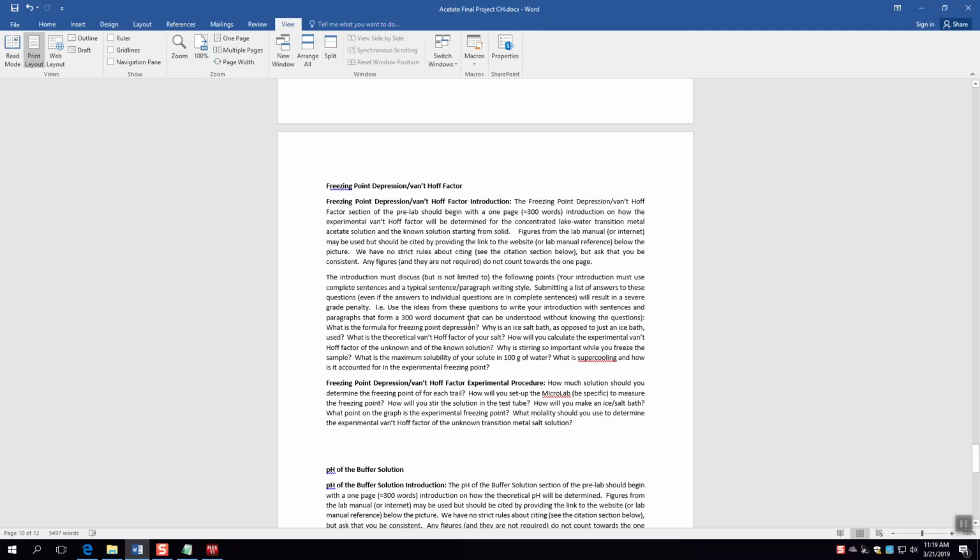So what is the formula for freezing point depression? Why are you using an ice salt bath as opposed to just an ice bath? What is the theoretical Van Hoff factor of your salt? It's 3. I gave you that one. All right. How will you calculate the experimental Van Hoff factor for your unknown and known solutions? We talked about how you're going to do that by actually freezing them. Why is stirring important when you freeze the sample?